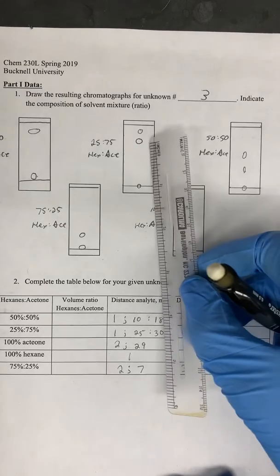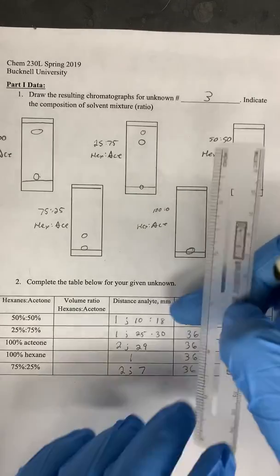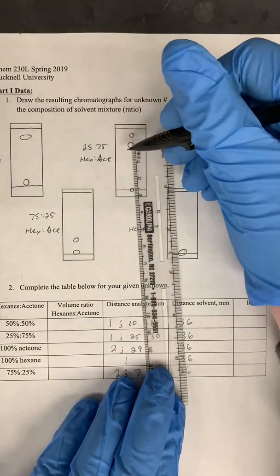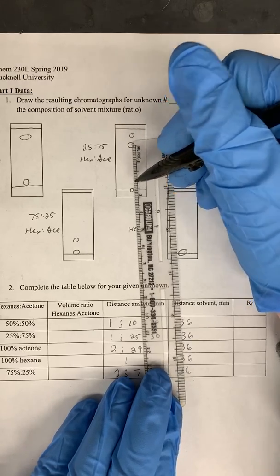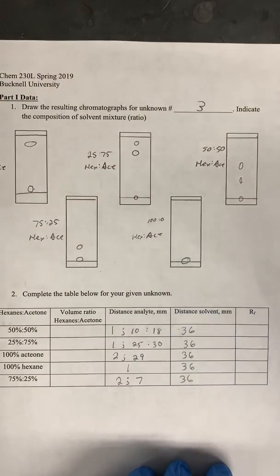And so you would hold your ruler in a way so that you measured the distance between this spot here, and we always do the center of the spot to the baseline, and then we would record that number down below.